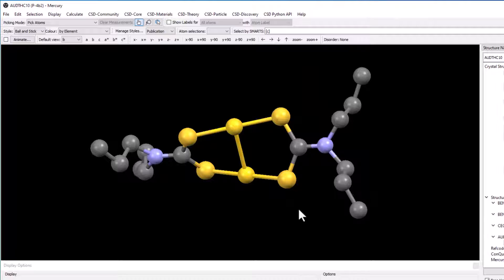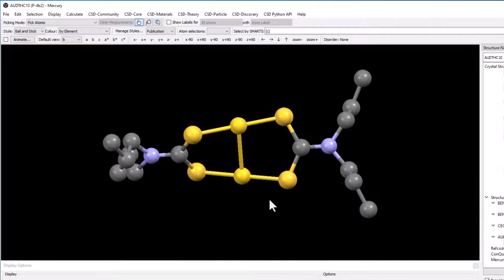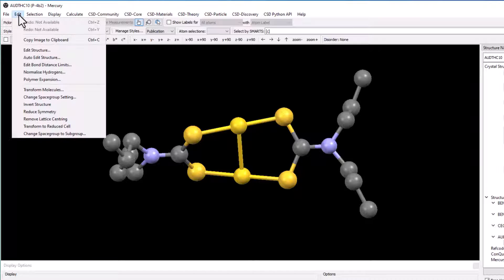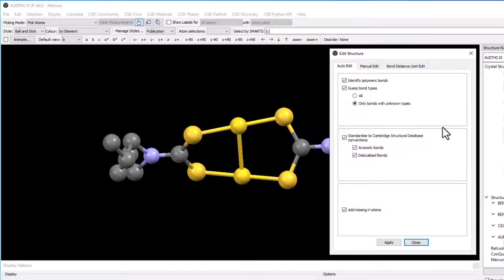Before editing the bond distance limits, the hydrogen atoms need to be added to this structure by automatically editing it. Go to the edit menu and select auto edit structure. The edit structure window will appear. Under the auto edit tab, we will leave the default settings as they are and click apply.